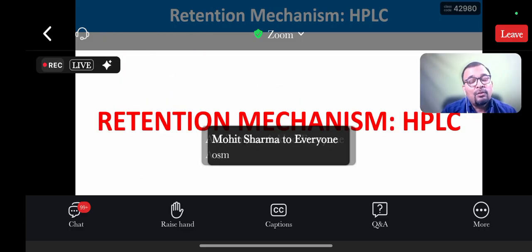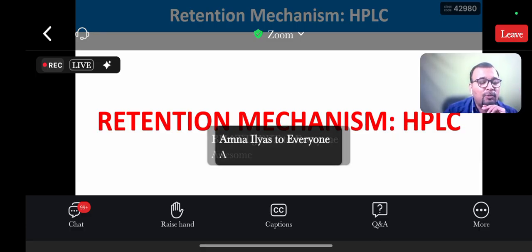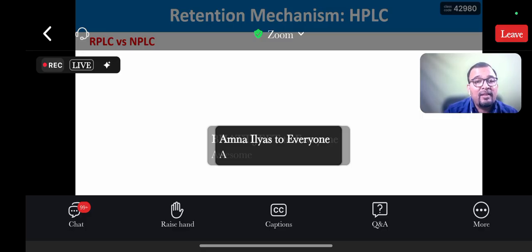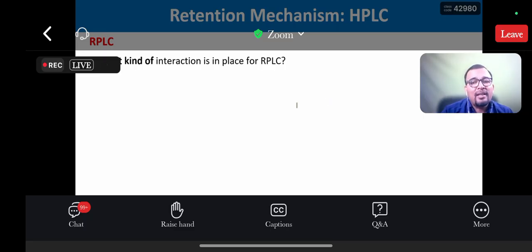Here I'm going to talk about non-polar and polar stationary phases, that is, reverse phase and normal phase liquid chromatography. Let us understand reverse phase liquid chromatography retention now.